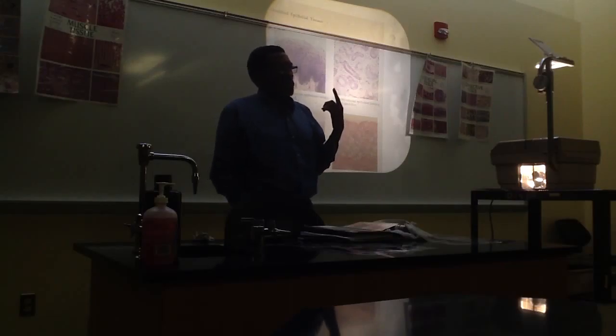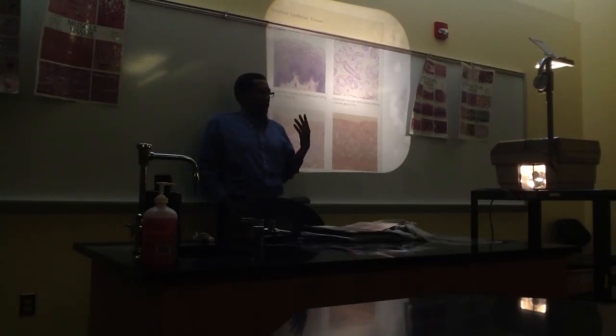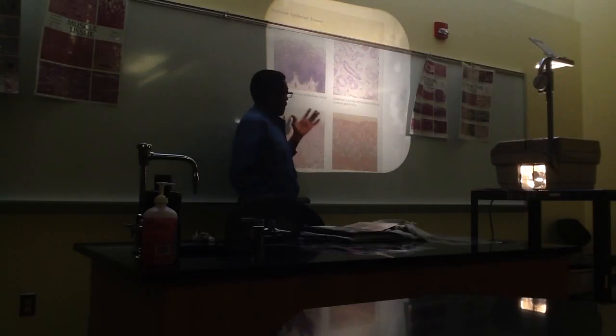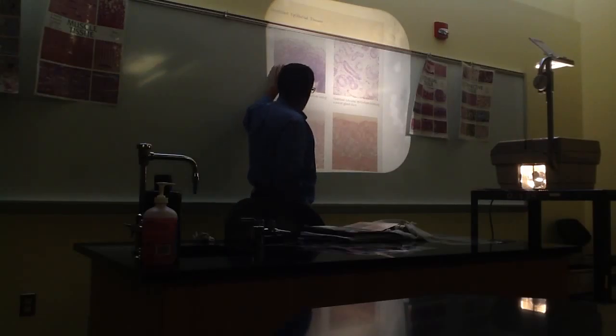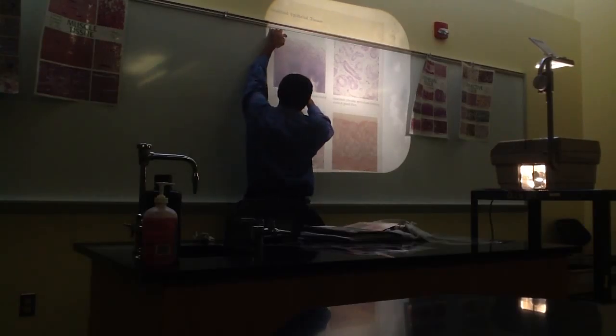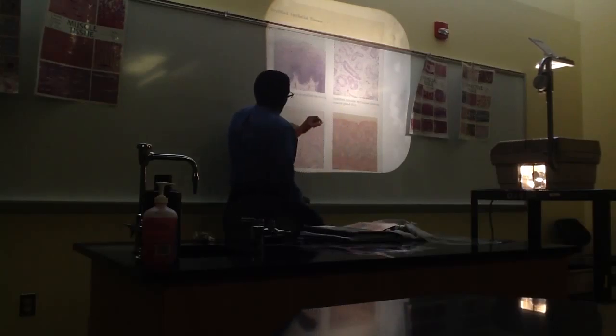And so according to the number of layers, how many different kinds of layers could we have? How do we name the tissues according to layers? Stratified. Simple, pseudo-stratified. Columnar would be a shape at this point. Simple, stratified, and pseudo-stratified. Okay, falsely stratified. Okay, so let's look at this tissue. Does it look like it's just one cell layer between the basement membrane and the free space? Yeah. All right.